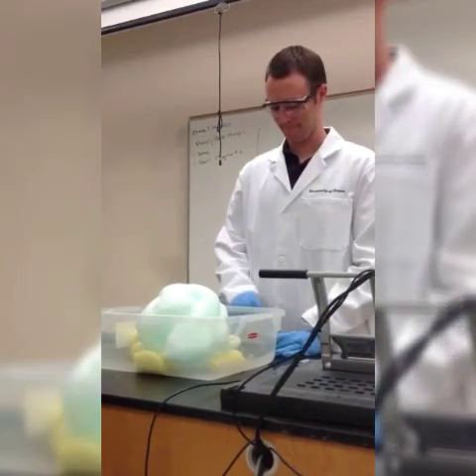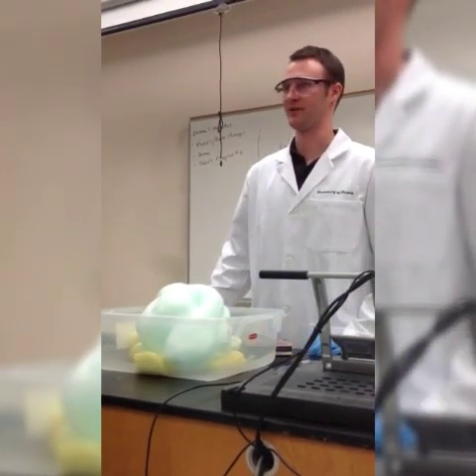By the way, when I do this for third graders, there you go.